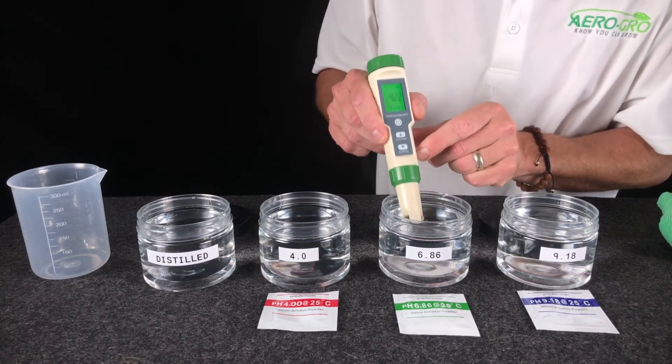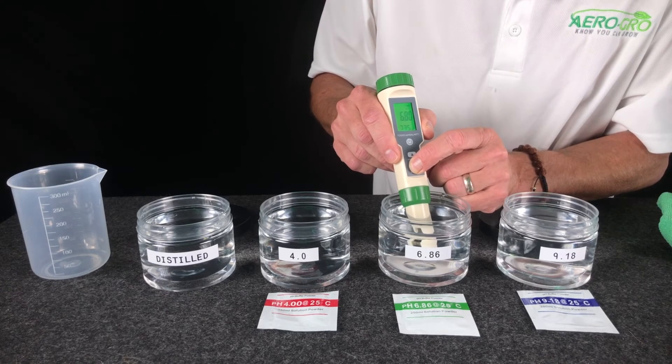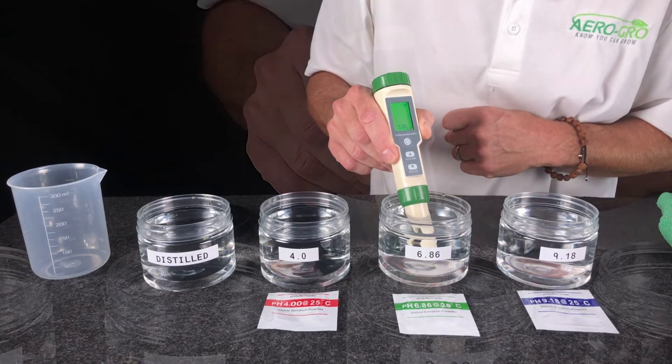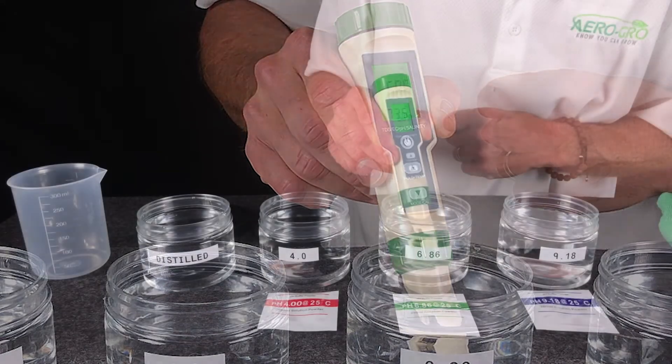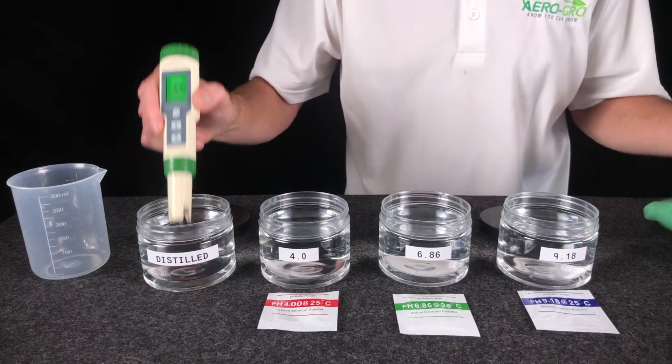Dip it into the 6.86 and press and hold the calibrate button — hold for a count of five, then let go. Let it calibrate and let it stop blinking. 6.86 — boom, right on the money. Rinse it off and dry.